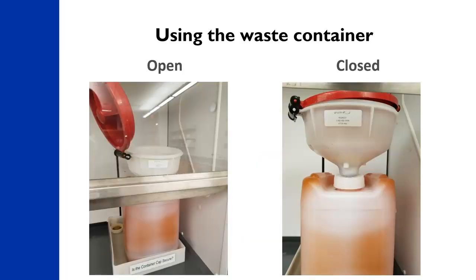Please double check before you pour your waste into the waste container that the funnel is open or in the up position as shown on the left, and not closed as shown on the right. When multiple students pour waste into the closed lid of the funnel, it becomes not only a safety hazard for others in the lab, but also a serious safety hazard that has resulted in injury of our personnel preparing your labs.